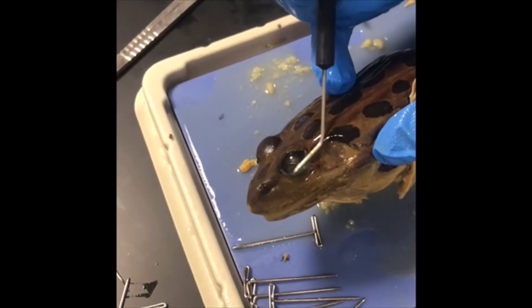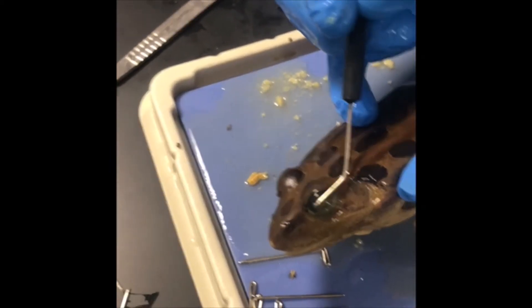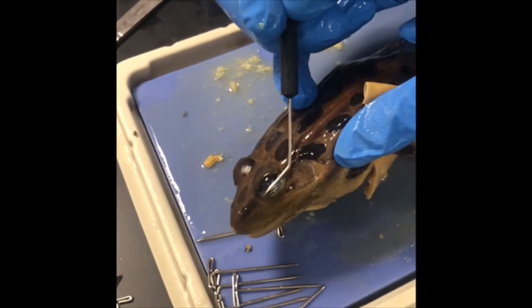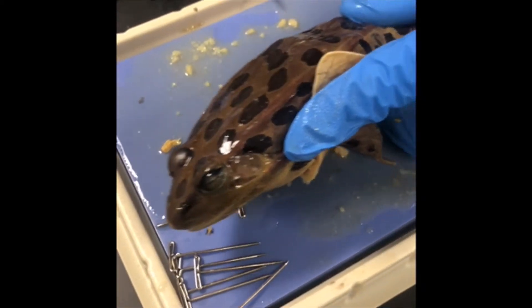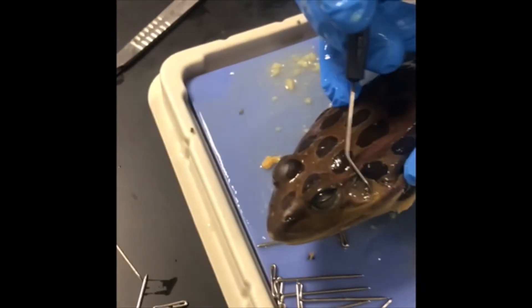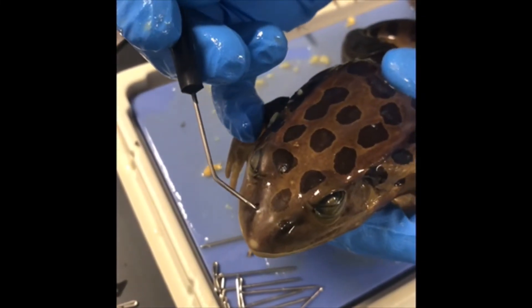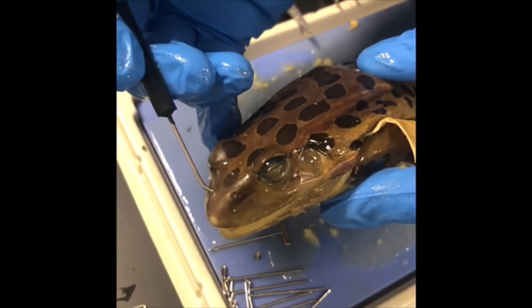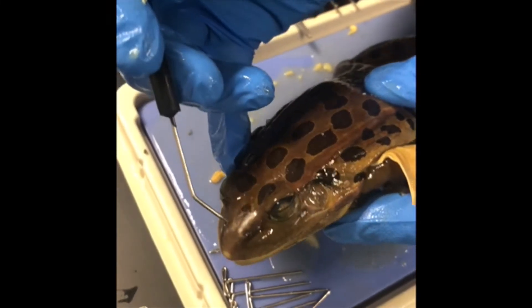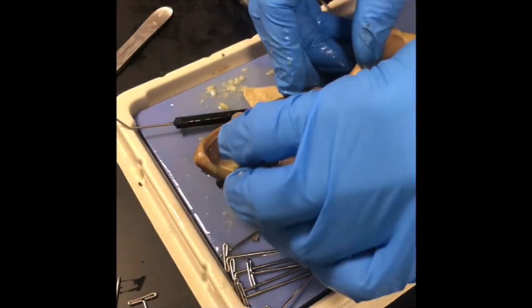The eyes can be covered with a nictitating membrane, which serves to moisten the eye. Locate the tympanum behind the eye. Examine the external nares, which are the nostrils. Insert a probe into the external nares and note that it protrudes from one of the paired small air openings, the internal nares, inside the mouth cavity. Flip the frog on its back.